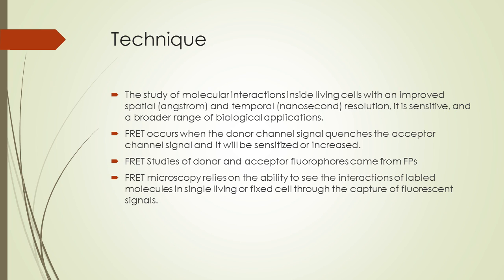FRET studies of donor and acceptor fluorophores come from FPs. FPs are fluorescent proteins and are a class of autofluorescent proteins. GFPs are green fluorescent proteins. All of the fluorescent proteins are carefully considered in the selection as workable FRET pairs.